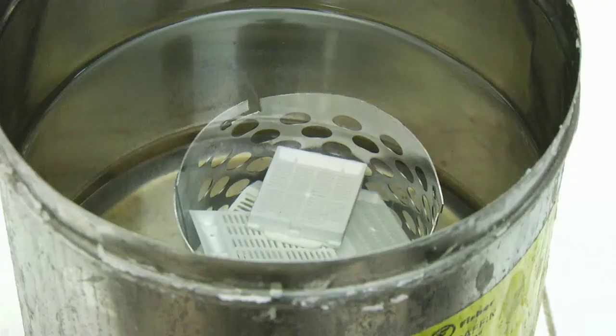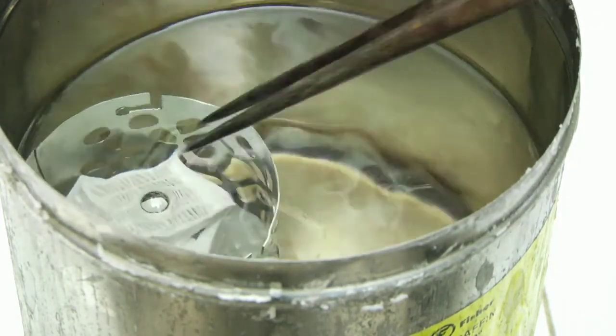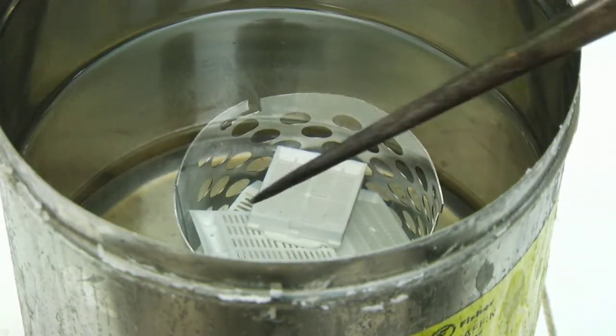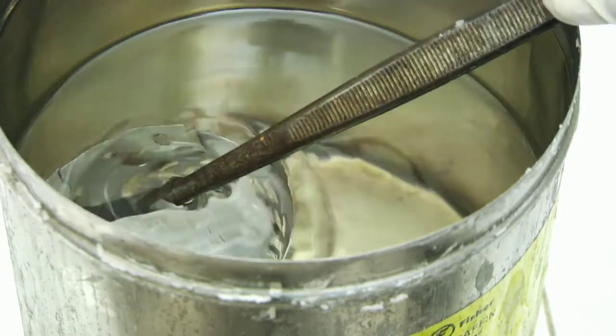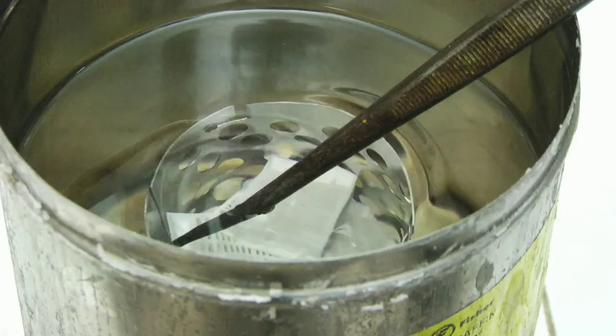Now, the water is driven out, but alcohol and wax are still immiscible. So, we need a reagent that can mix with both alcohol and wax and can act as a bridge between the two. This reagent is the organic solvent xylene. So, we immerse the tissue in xylene and drive out the alcohol. This step is called clearing. Multiple changes may be required to clear the ethanol.